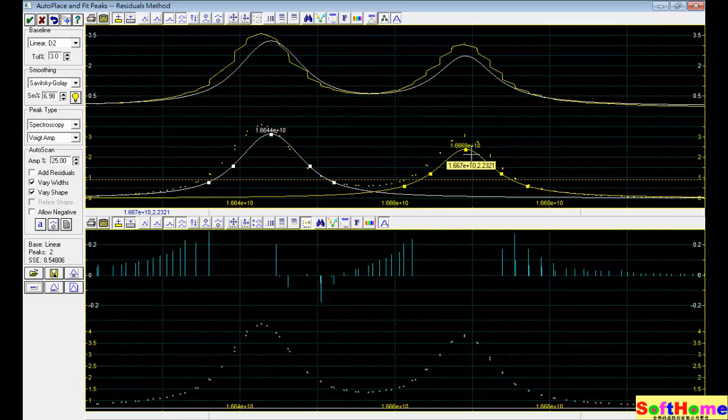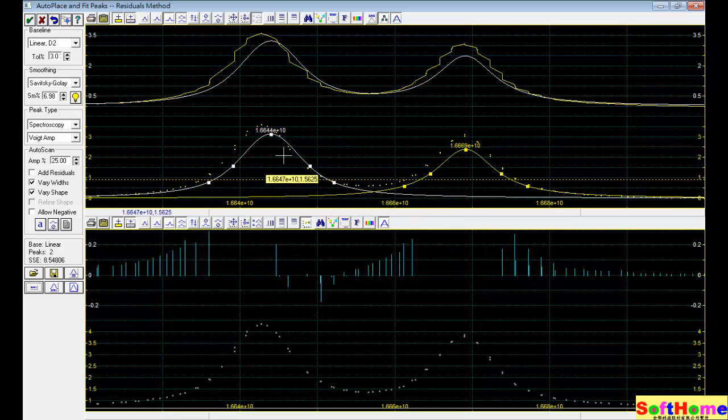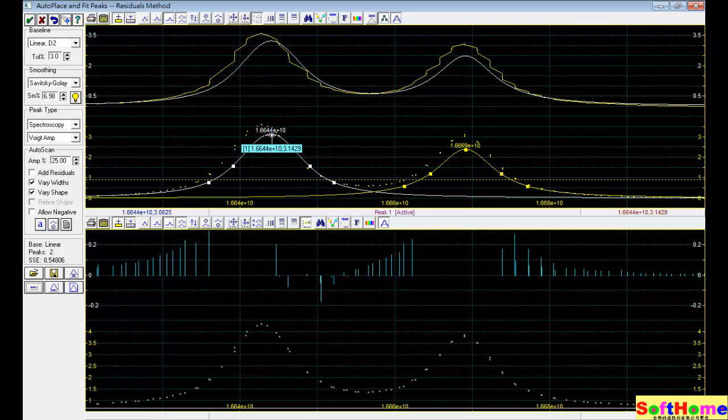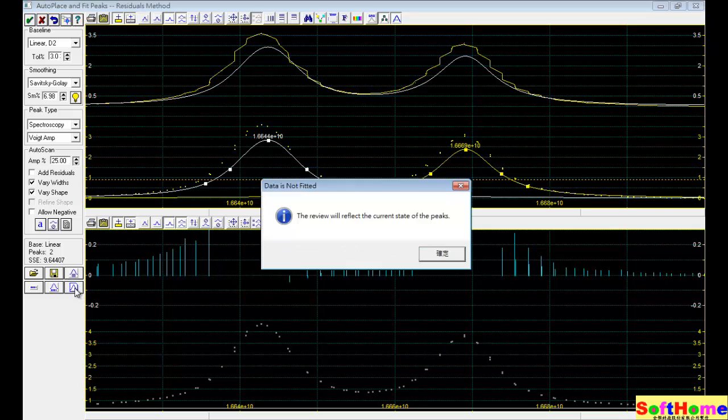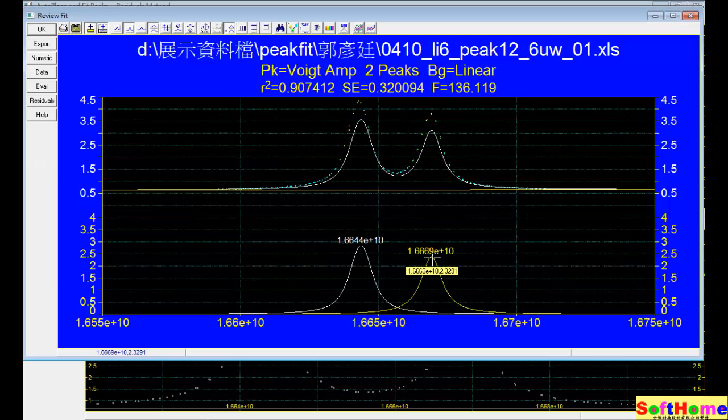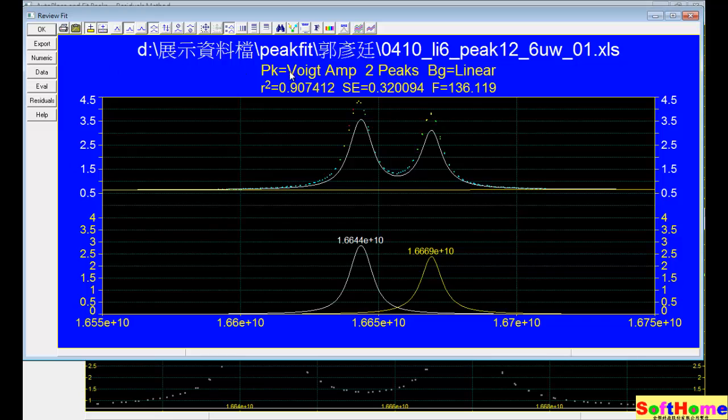So how to fine-tune. You can use this method. And there's still another method. We'll show you later. And we can show the detailed result. And R2 now is 0.9. Actually, it's very poor.